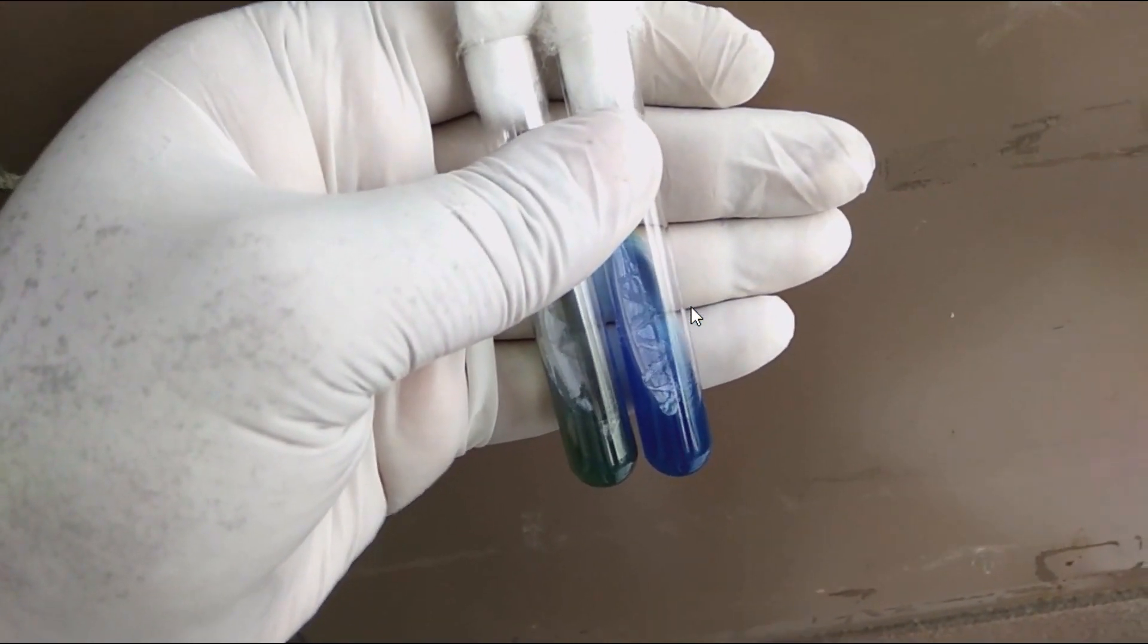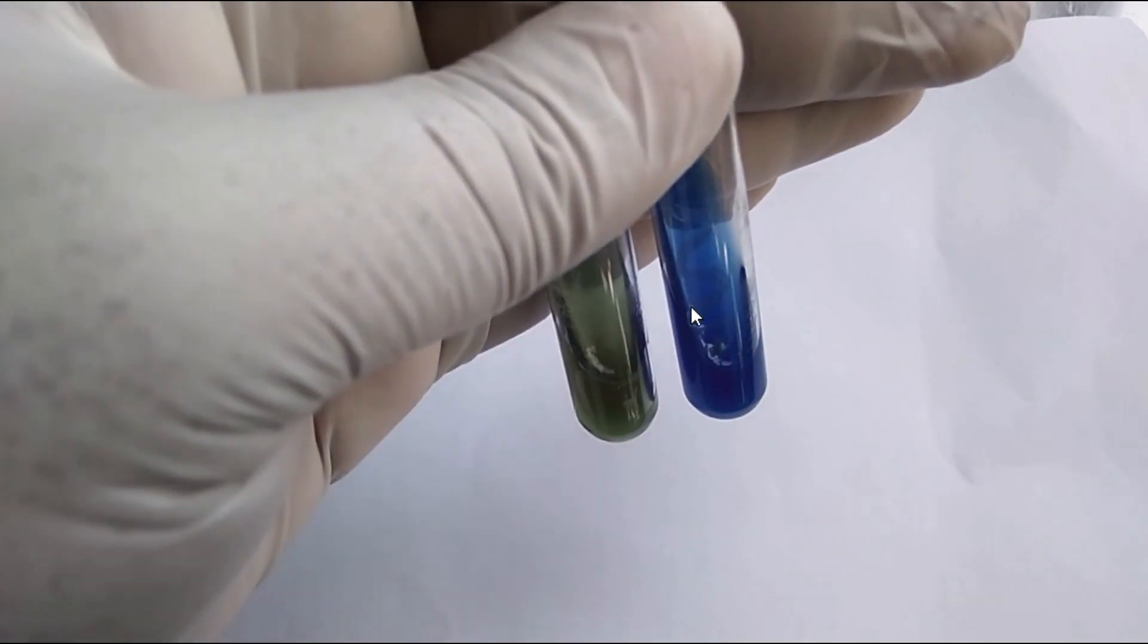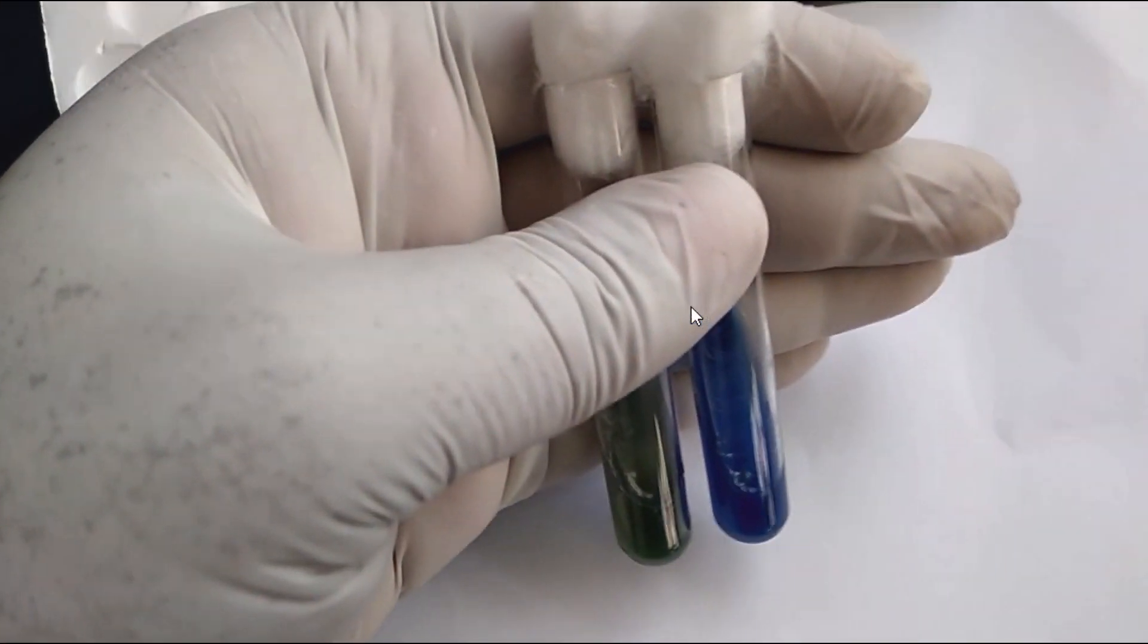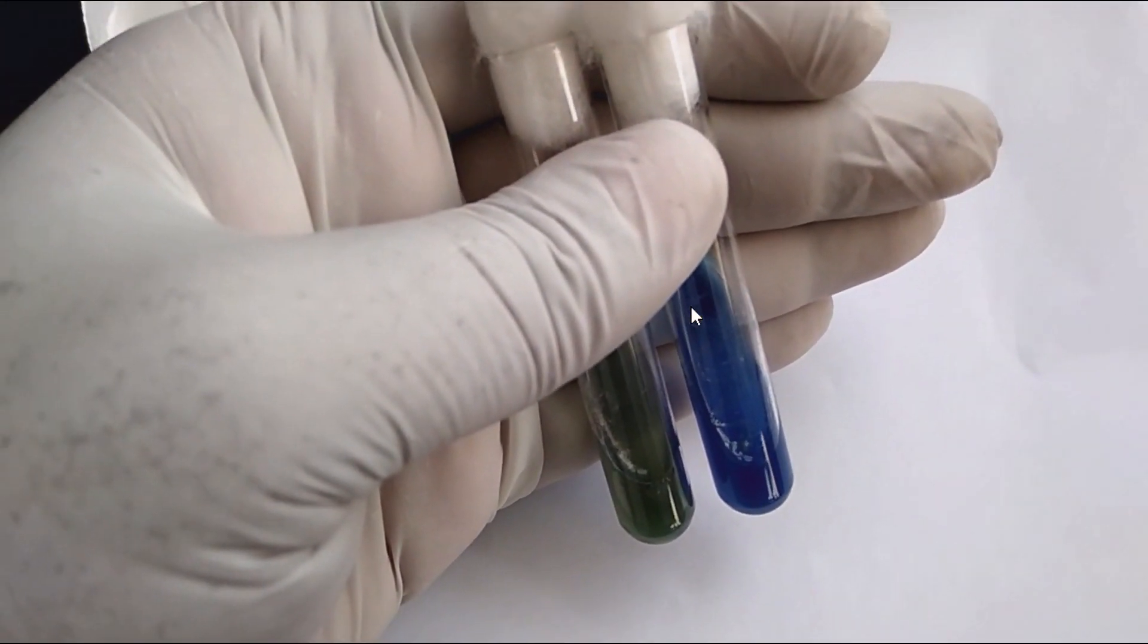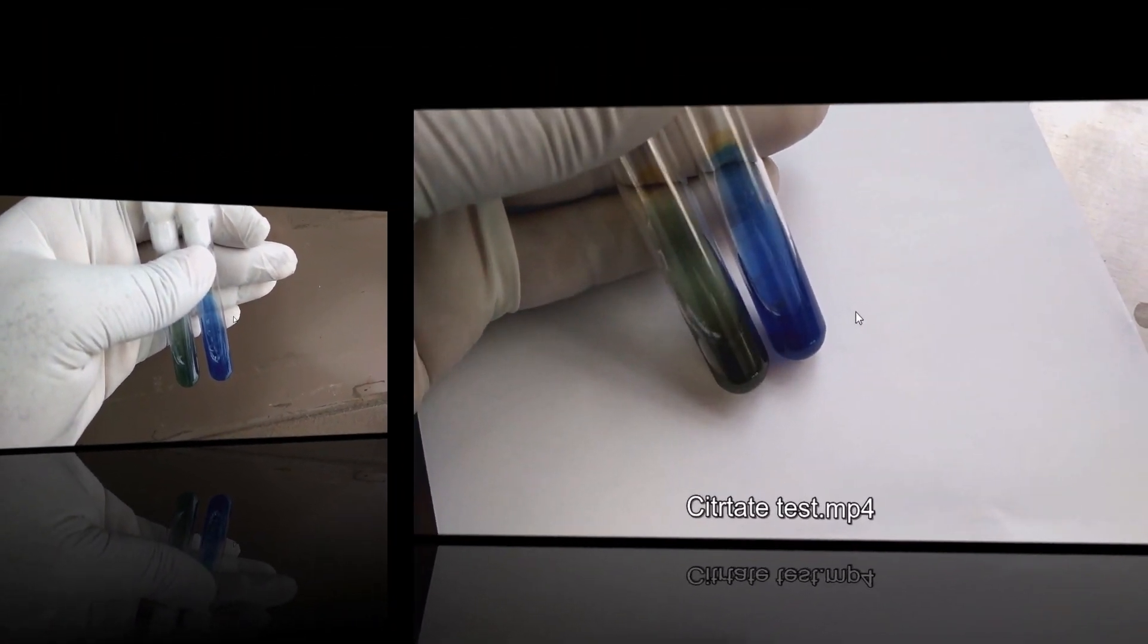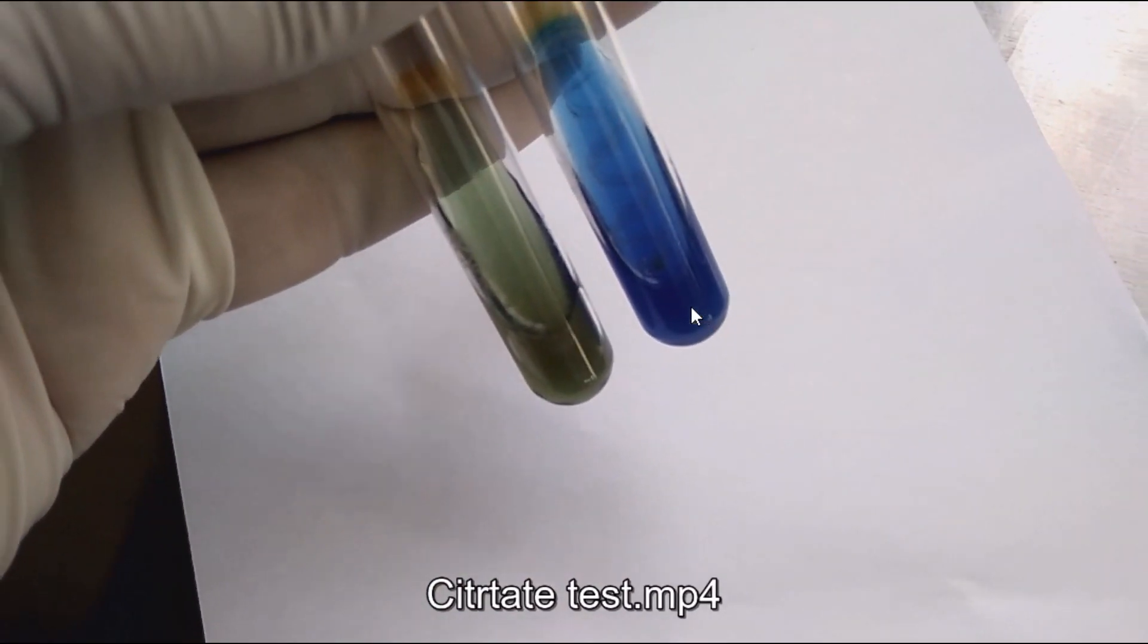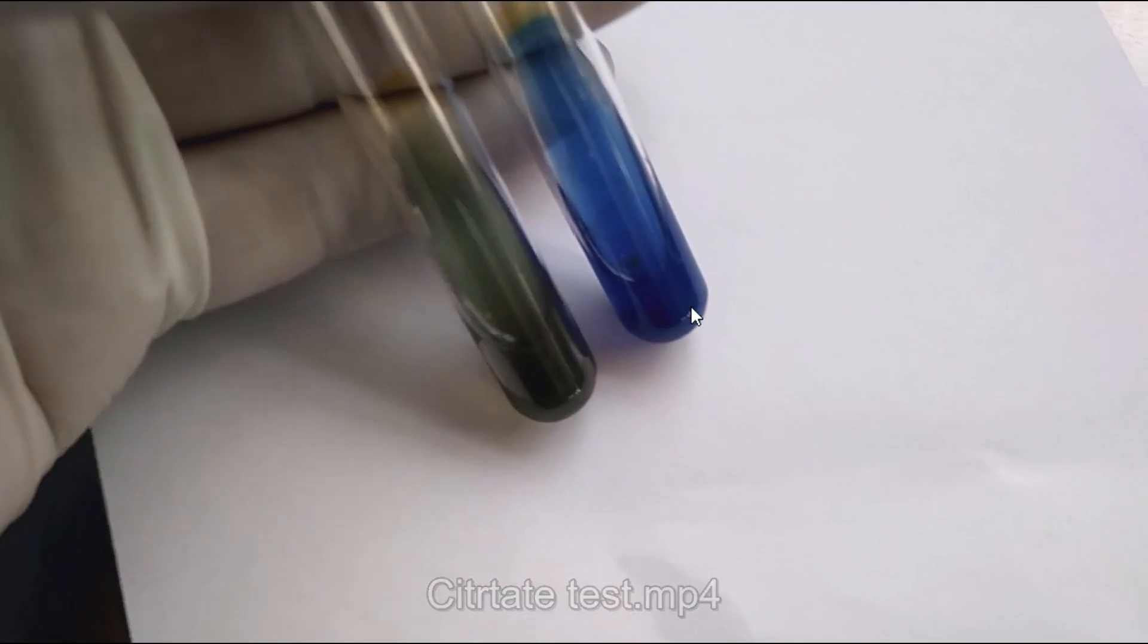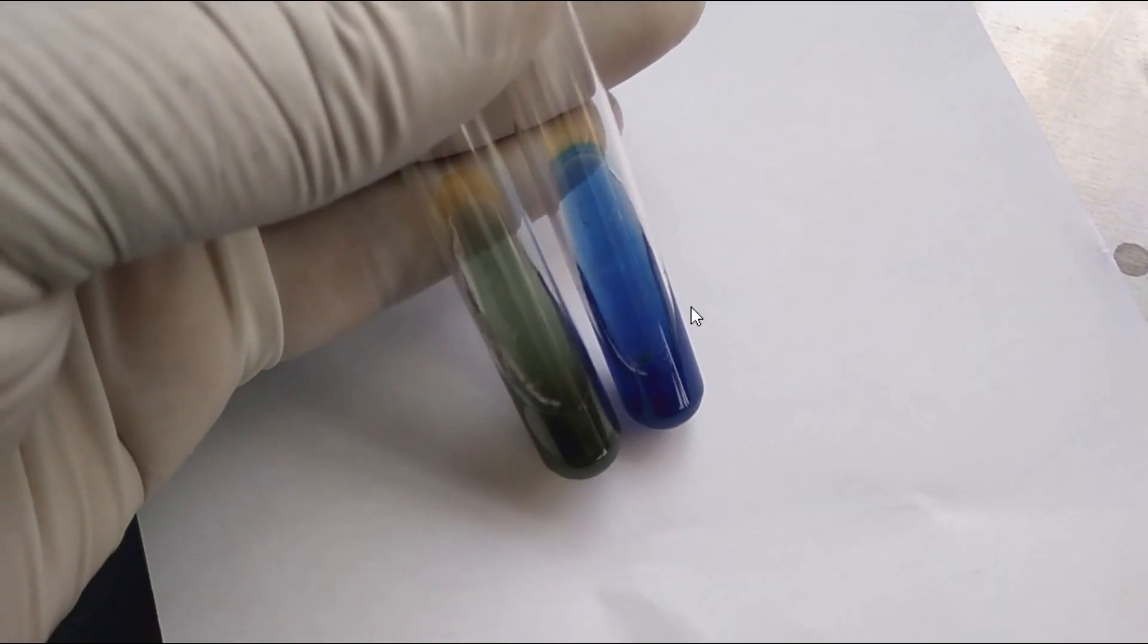Some other bacteria that are citrate positive include Citrobacter, Enterobacter, Serratia, Providencia, and some strains of Vibrio and Proteus.